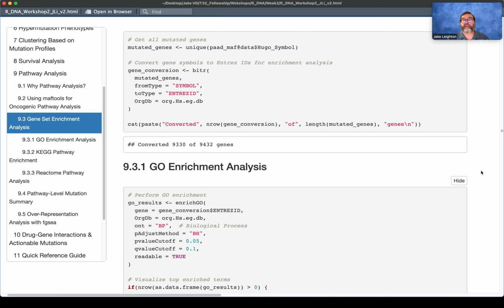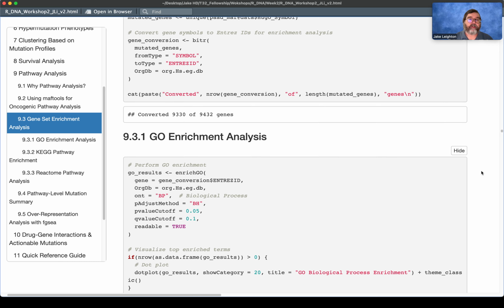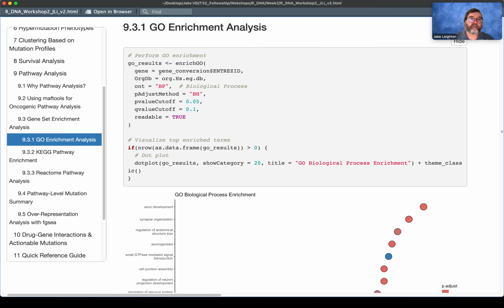That's what we're trying to do. And we're not just matching and saying, hey, do genes match pathways? They have to be in those pathways more than background to be expected, right? So now we have those genes converted. So the more genes you can do, the better. But remember, you can choose less if you want.